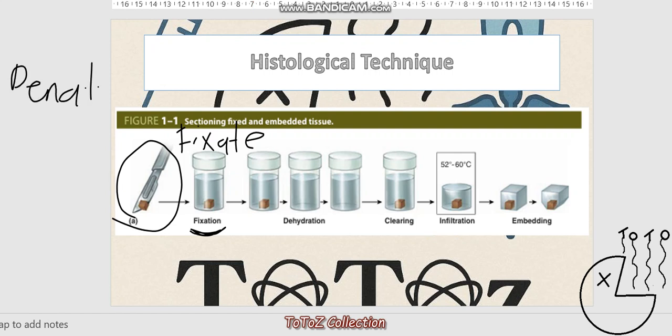You're going to denature all the proteins in the sample, because usually what happens is this: you cut off a tissue from its support system, or from its supply of nutrients and oxygen. It's supposed to start dying, and after it starts dying, its entire structure starts withering. After that, it starts degrading. One of the things that aid in the degrading of the tissue are the enzymes that the tissue actually has. So there could be enzymes inside the tissue that will start eating up the tissue itself.